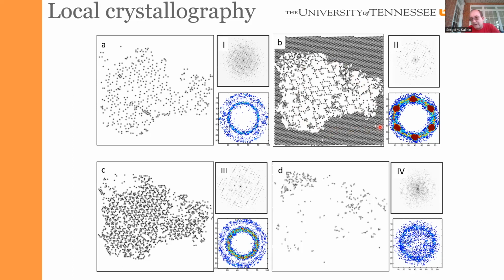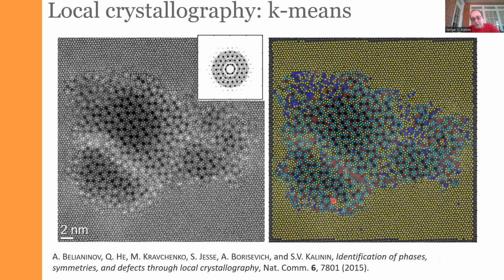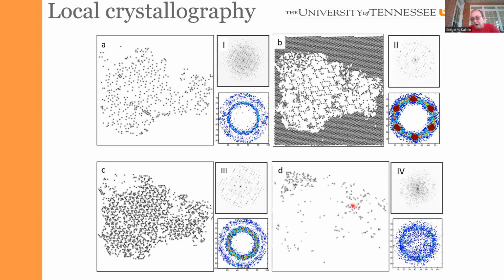So you see that these are atoms which are sitting almost on the ideal hexagonal lattice. These atoms clearly have some structure, so there are some peaks and some ordering here. These atoms seem to belong to some form of amorphous phase. At least it is considerably more spatially delocalized. It seems to be sitting, roughly speaking, on the boundaries between these phases.